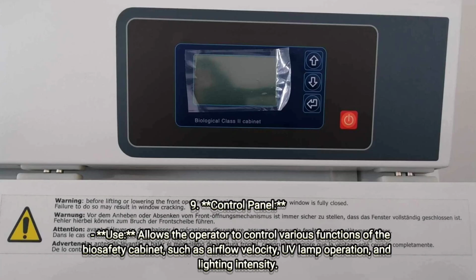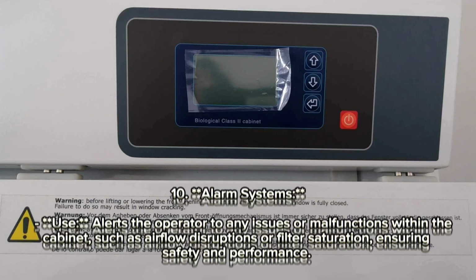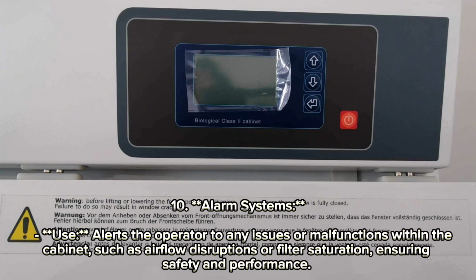Control panel allows the operator to control various functions of the biosafety cabinet, such as airflow velocity, UV lamp operation, and lighting intensity. Alarm system alerts the operator to any issues or malfunctions within the cabinet, such as airflow disruptions or filter saturation, ensuring safety and performance.